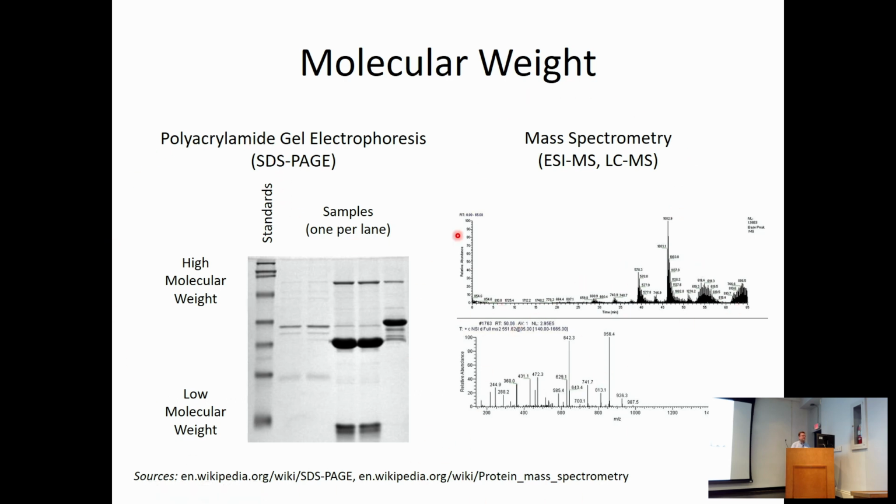Most of you, if you're working with proteins, though, will do SDS-PAGE, which stands for sodium dodecyl sulfate polyacrylamide gel electrophoresis. Don't worry about that. SDS-PAGE is much, much easier. But most of you will be doing this, if nothing else, to assess the purity of the proteins that you might make over this summer.